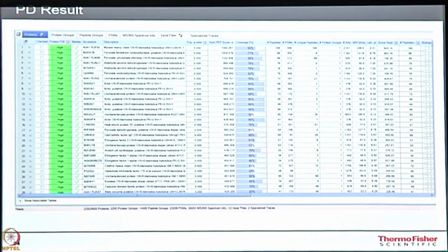A unique peptide is one present only in that protein and not in any other protein in the database you are using. We are looking for at least 2 or more unique peptides. That kind of data will be very good data.